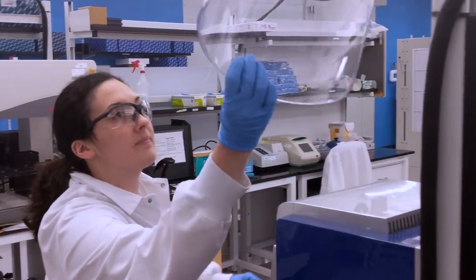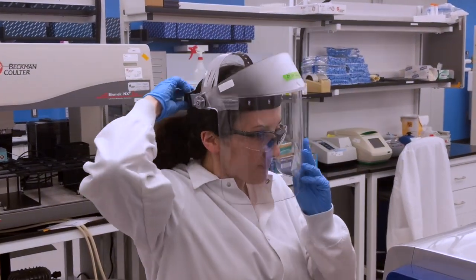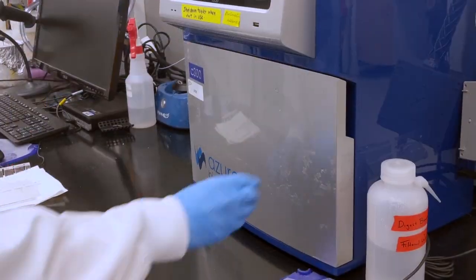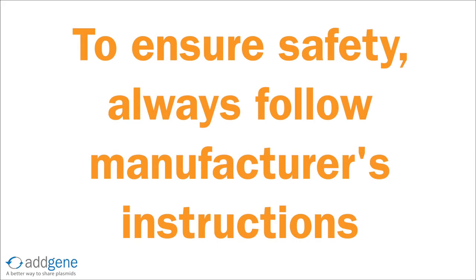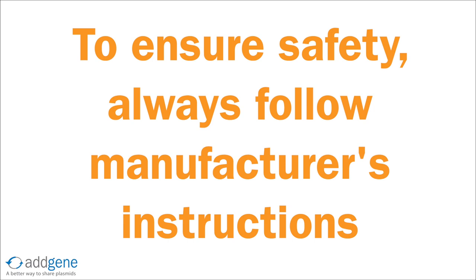Before working with UV light, always wear a UV light-blocking protective face shield and cover exposed skin. Different UV imagers will have different instructions for band excision. To ensure safety, always follow the manufacturer's instructions.